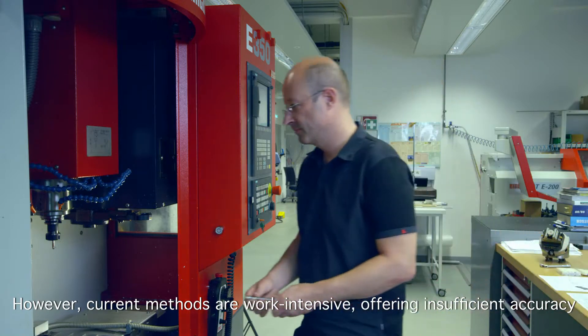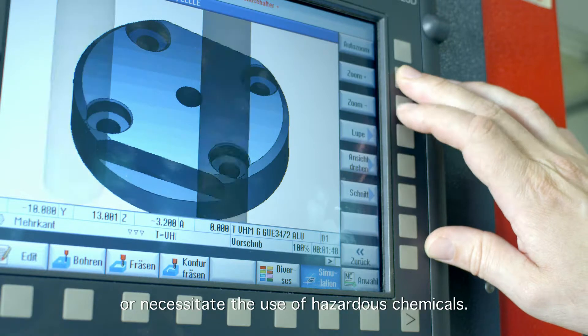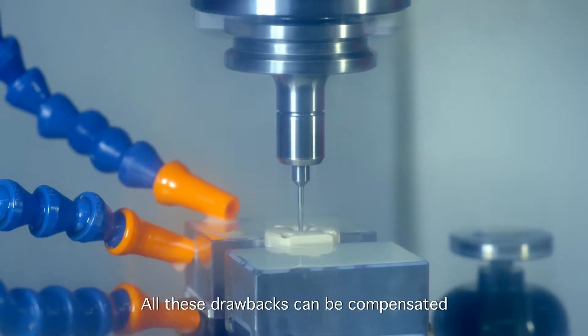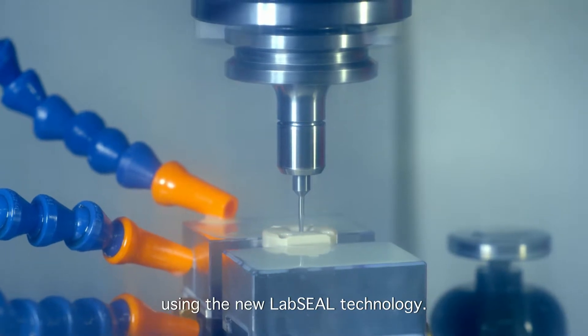However, current methods are work-intensive, offering insufficient accuracy, or necessitate the use of hazardous chemicals. All these drawbacks can be compensated using the new LabSeal technology.